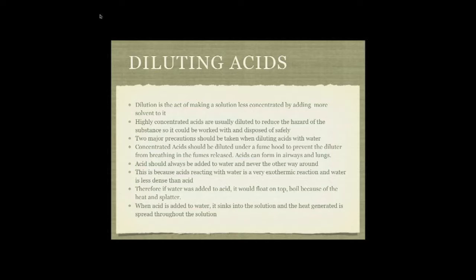Secondly, acids should always be added to water and never the other way around. This is because acid reacting with water is a very exothermic reaction, and water is less dense than acid. Therefore, if water was added to acid, it would float on top, boil because of the heat, and splatter. When acid is added to water, it sinks into the solution, and the heat generated is spread throughout the solution.